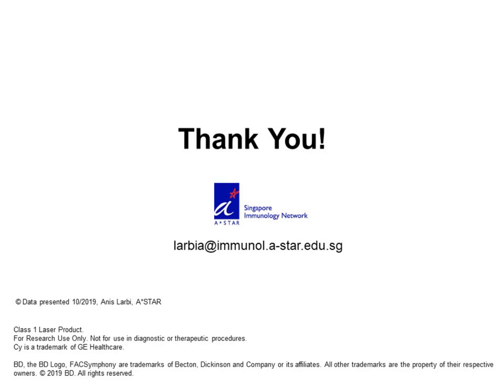Thank you, Dr. Larby, for that exciting presentation. Our first question from the audience is, can you please highlight the importance of using a viability dye in these high parameter panels?